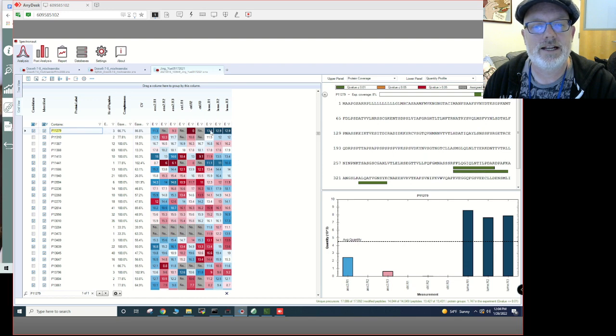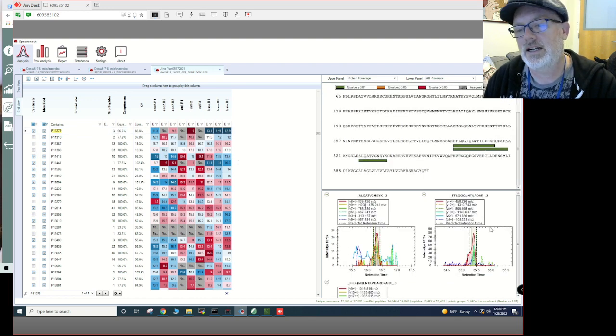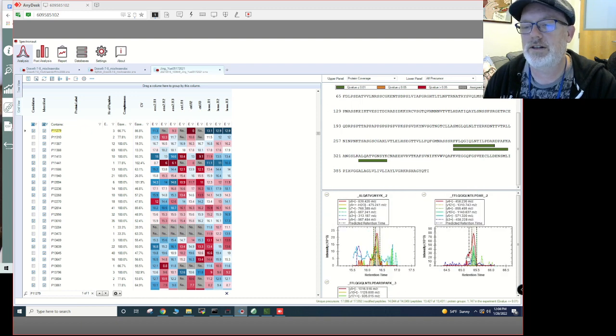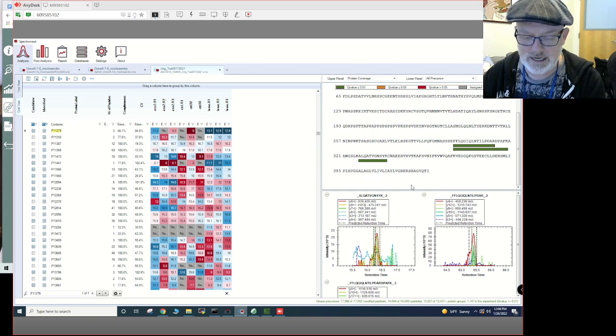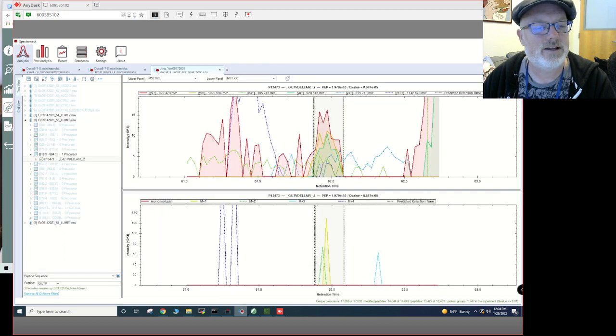Let's look at them by clicking on here. And you can see kind of the peptides. This one doesn't look very good. These 2 look pretty solid. We could do, let's look at the ALQATVG and SYK. Unfortunately, you can't click on it, but I'm not going to click on it because I think it messed something up last time.